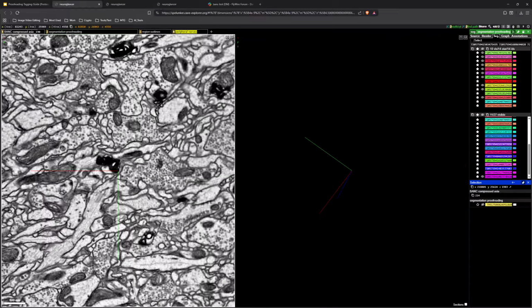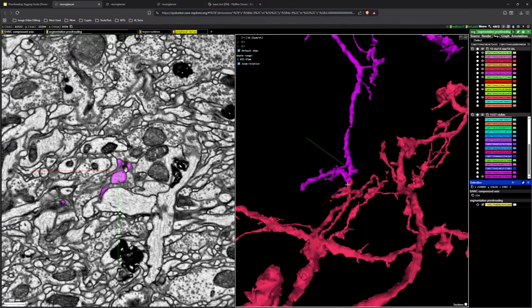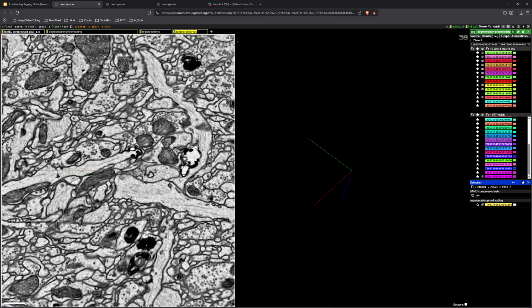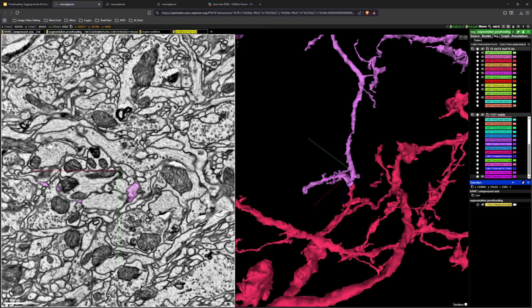That's probably an indication of some issues, as well as this perpendicular branch. Maybe this cell goes up in this way. So use your best guess here, following that segment we originally clicked.